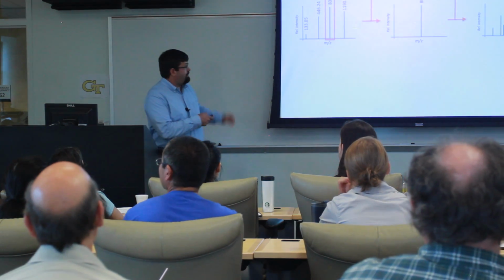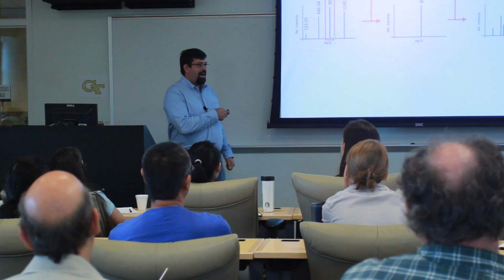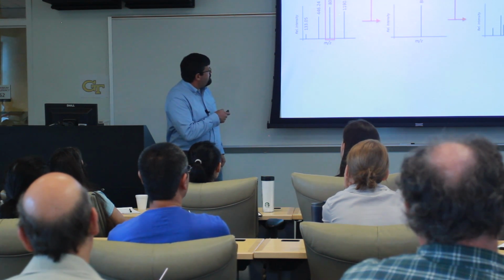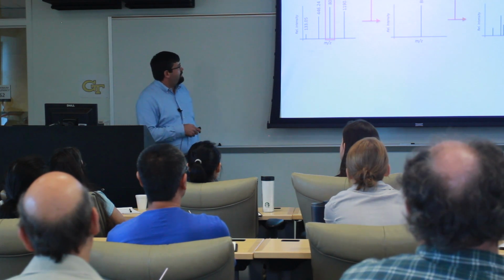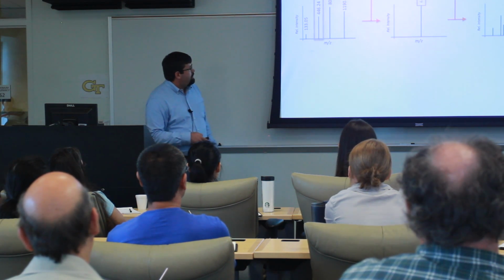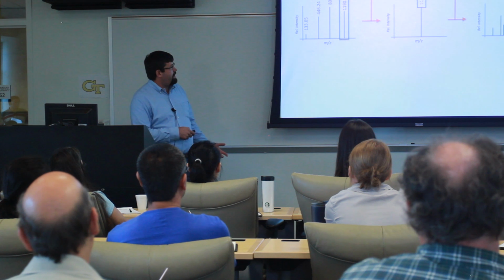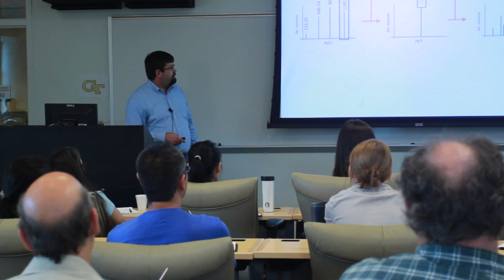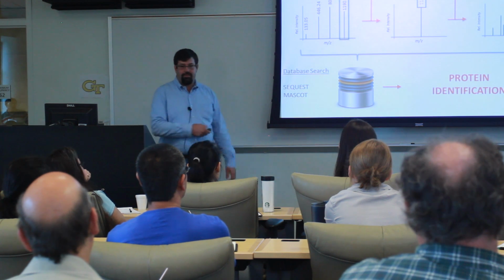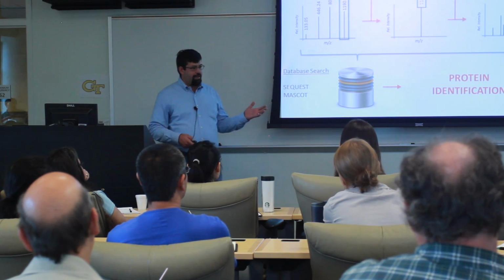You could manually look at that MS spectrum and then say, oh, I'm interested in these 3 ions. I would like to sequence those 3 ions. You can then isolate them one at a time, generating a different tandem mass spectrum or MS-MS spectrum, and then take that information and search it in the database. You could do that manually.